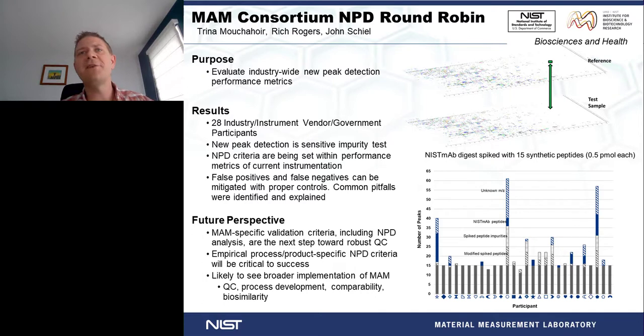So in the paper, we'll actually go through some of those individual nuances where we were able to dig deeper into the raw data and find some of those false negatives and false positives, and then some recommendations for how to go about watching out for these potential pitfalls that one could run into.